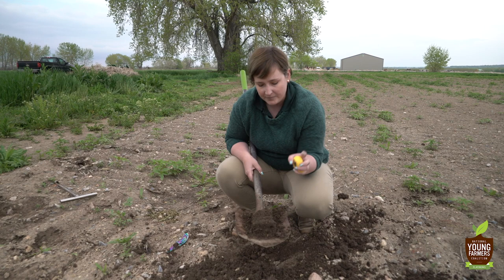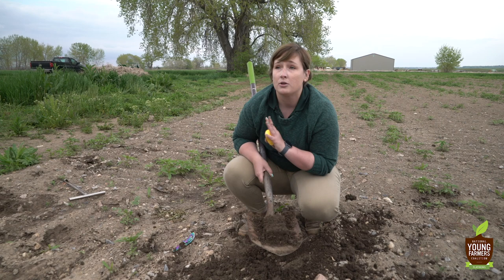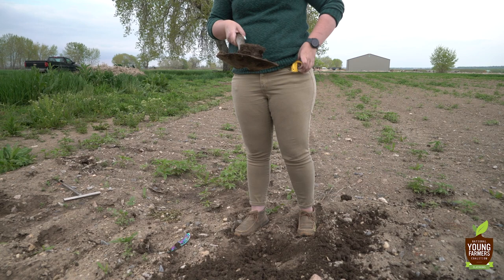I'll mix this with all my other samples. I will take about 1 cup to 2 cups and let them air dry. Don't put them in a plastic bag, leave them out on cardboard, let it air dry. Don't put them in the oven, and then put it in my collection bag. Don't oven bake them. I'm serious. I'm not surprised someone has done that before. But it will destroy some of the compounds, and it will skew your results.